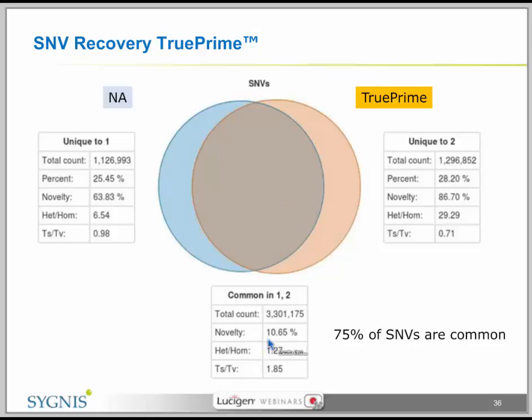And the parameters, the heterozygote homozygote ratio of 1.27 and the transition transversion ratio of 1.8, point towards that most of these are real SNVs. So this is a really good value, I think, for this amplified single cell DNA. We detect about 3.3 million in total, and the space that lies outside this overlap in both samples, the parameters in this outlier space point towards that these are all false positives due to the very high sensitivity of the method we use. And you see this here, the novelty rate in those SNVs is really high, 87%. So this is all likely false positives. The same with the non-amplified sample.